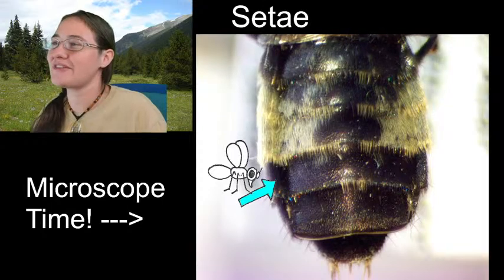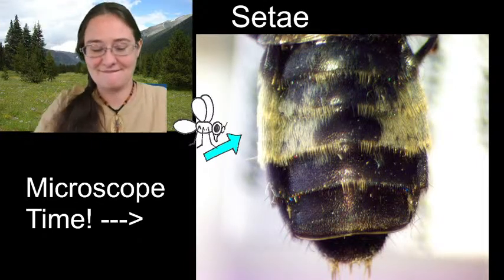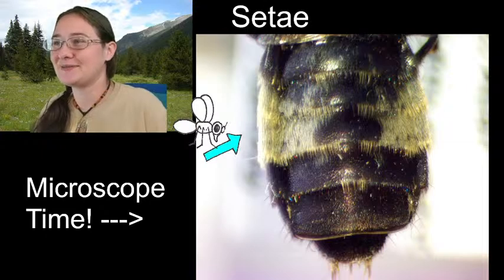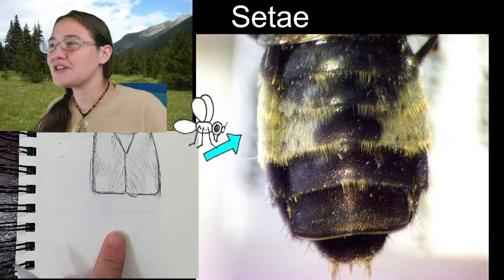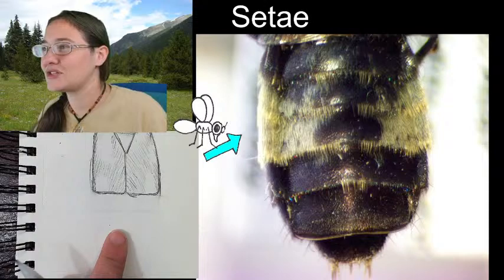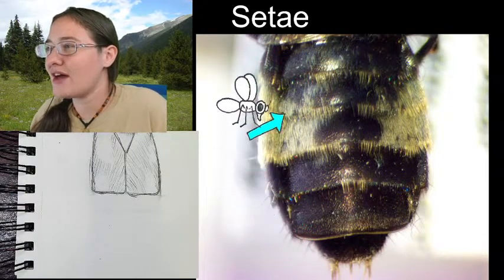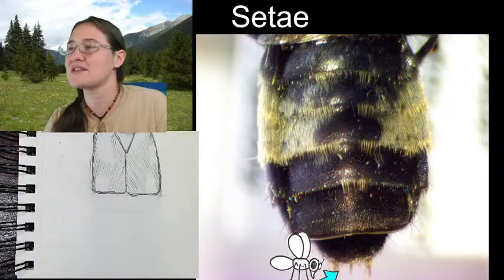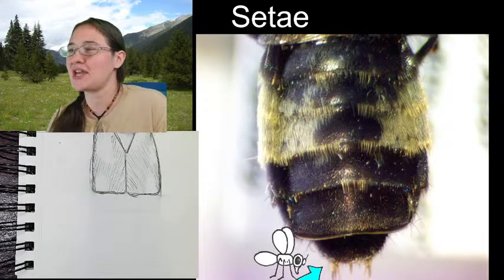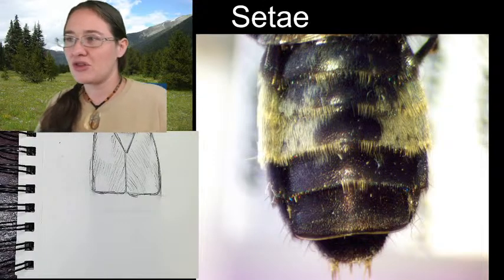Alright, now this is going to be fun because I think I'm only going to be able to fit about 3 segments of the abdomen before I run out of paper. Watch me do that. Alright, so I've got my head, my pronotum, my elytra, my scutellum, and we're moving down here to the abdomen. There are 6 visible segments: 1, 2, 3, 4, 5, 6. The first 5 are very plate-like, and they look like they can fit into one another. The 6th one is a lot thinner. And then we have some protrusions at the end, way down here. We'll have to zoom in to check out what those are. I do know that there are some rove beetles that kind of look like earwigs, so I wonder if some rove beetles have those modified to be a little bit longer.